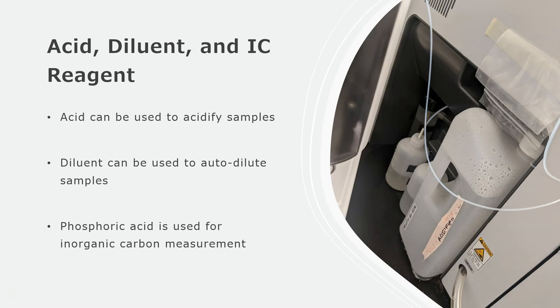There are also five bottles on the side of the TOC that need to be checked regularly. Three of them are the hydrochloric acid, the diluent, and the IC reagent which is phosphoric acid. The acid bottle is used for acidification of the samples, which is nice if you haven't acidified them yourself. Acidification of the samples is necessary for the TOC and we'll talk about that later. The diluent bottle is also nice since the instrument has the ability to auto dilute your samples and your calibration curve. Making calibration curves is a pain, so having the instrument do it for you is a great option.